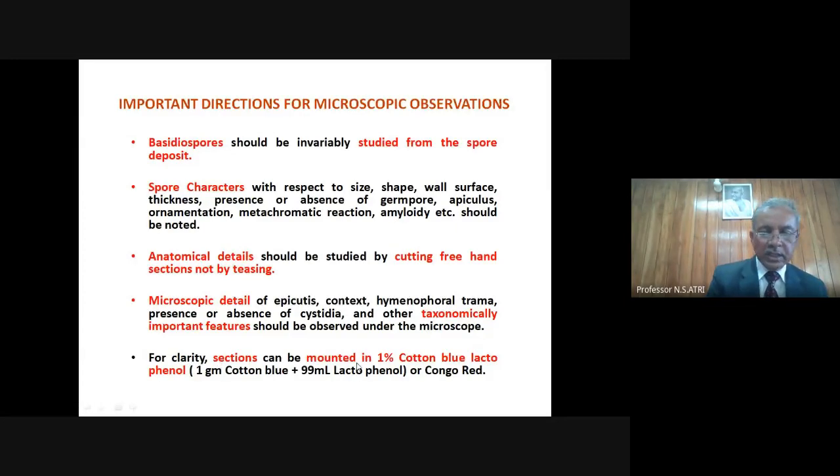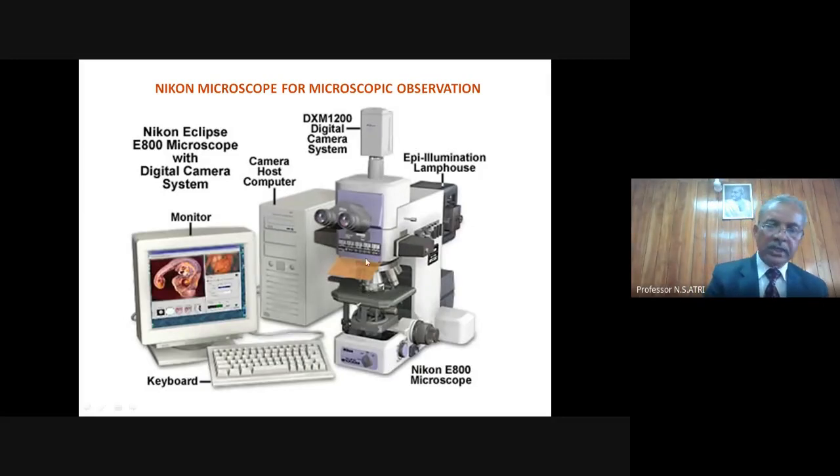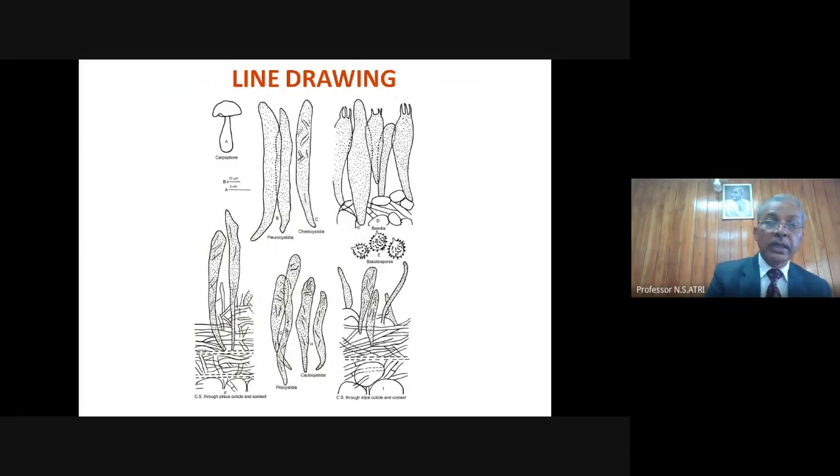For clarity, sections should be mounted in 1% cotton blue lactophenol or in Congo red. So these are fungal stains. This is the Nikon microscope we used at that time. And now you have microscopes available with an attached camera lucida. You can use them. And line drawing, camera lucida drawing, is an obligatory requirement. We had the MSI conference from 22nd to 24th this year at Patiala. We had a lecture by Hibbett, and he also emphasized the relevance of line drawings. It is an obligatory requirement.